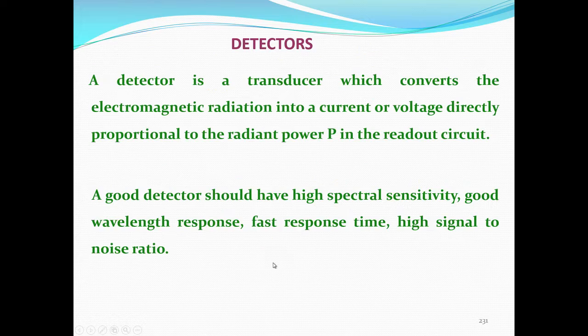Okay. So, now we come to the detectors, because that is all I can tell you about the sample compartment. Once the radiation passes through the sample compartment, I told you that both the reference and sample beams are brought into focus into a single beam, and then that needs to be sent to the detector to find out what the absorbance is.